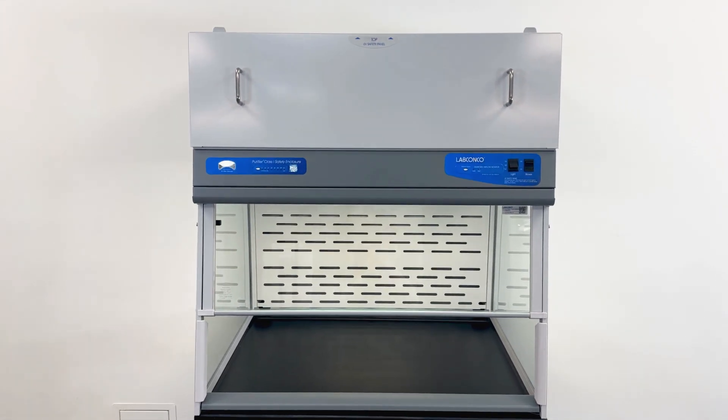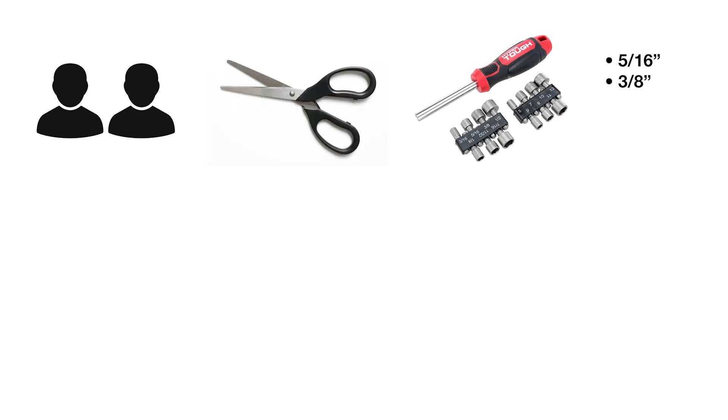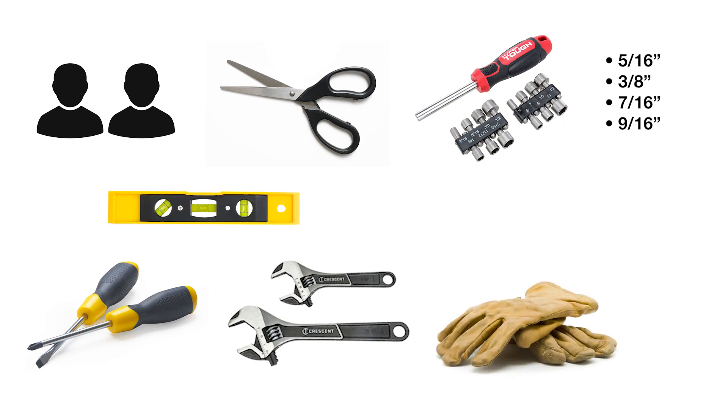In this video, we'll cover how to unpack and assemble your LabConco small enclosure. You'll need at least two people, scissors, a 5/16 inch, 3/8 inch, 7/16 inch, and 9/16 inch wrench and/or nut driver set, a Phillips and flathead screwdriver, two adjustable wrenches, a level, protective gloves, and safety glasses.